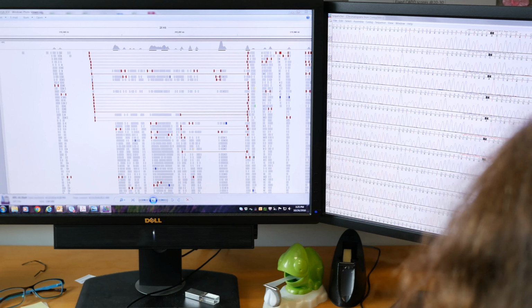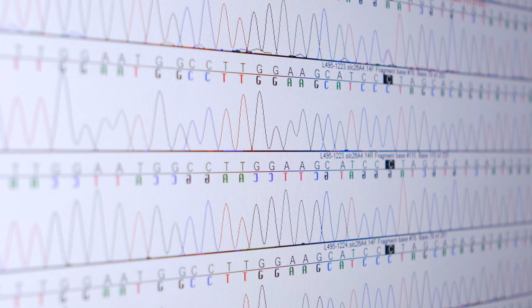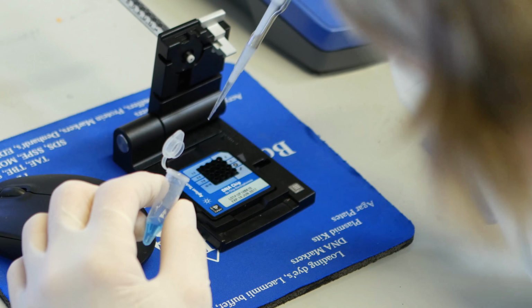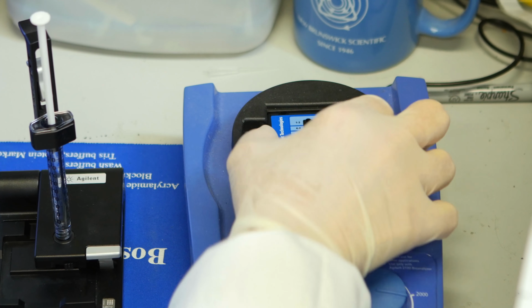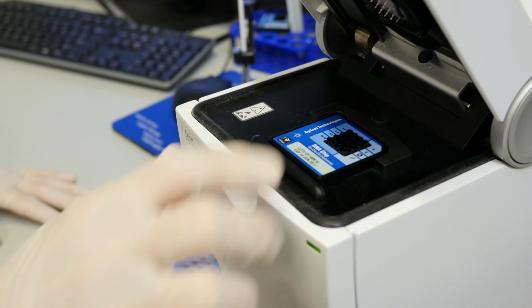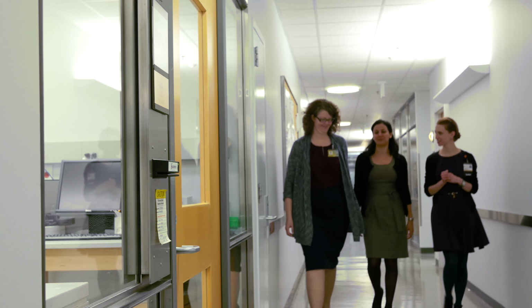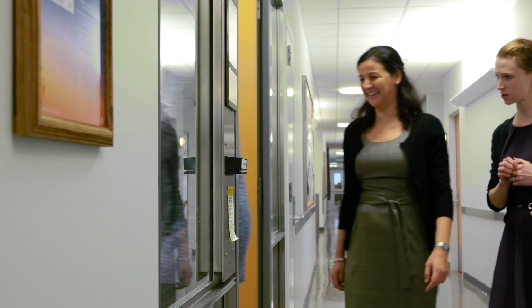Using our hearing loss panel, we've been able to identify novel mutations that lead to hearing loss. We've been able to reclassify variants that were previously thought to be pathogenic to benign. We've also been able to unravel the genetic underpinning associated with deafness in specific populations. There are other pieces of the genes that we've identified as being important. So certain genes have deep intronic variants that have been shown to cause genetic hearing loss, and we want to make sure that those are really well covered.